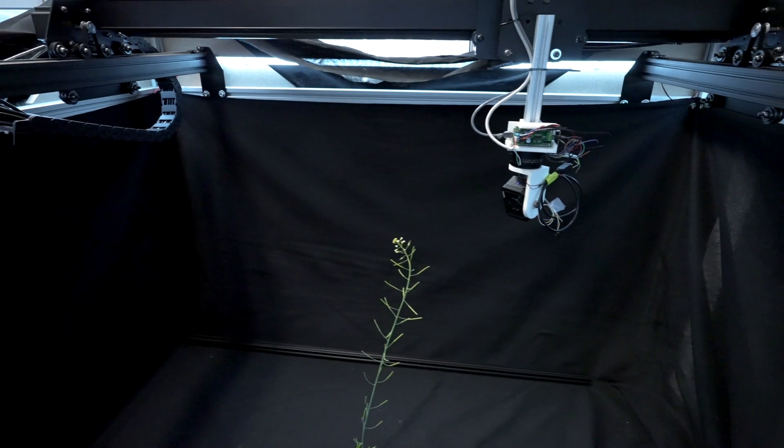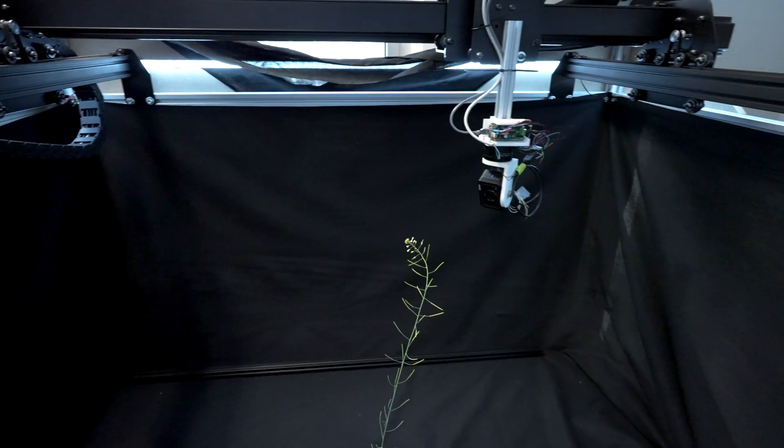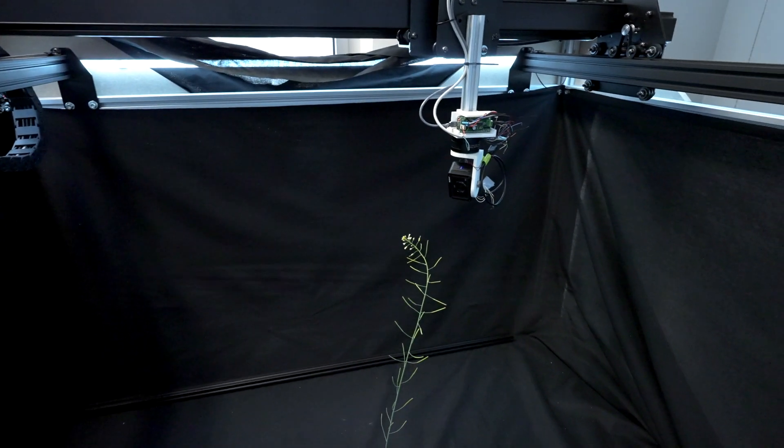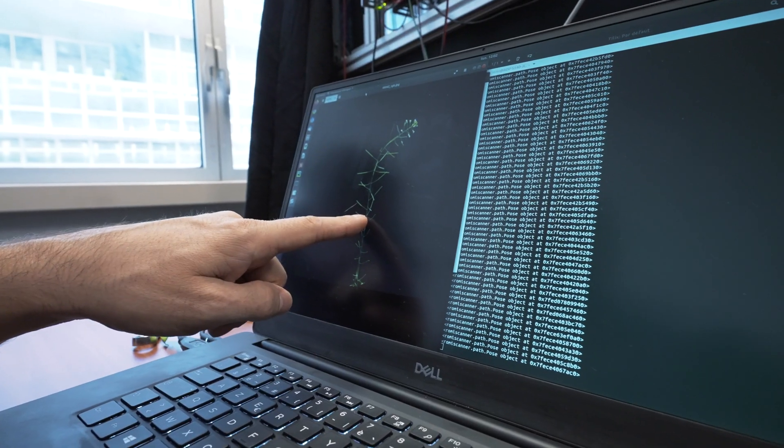The robot creates a phenotype of a single plant in a few minutes and can take up to a hundred in a day.